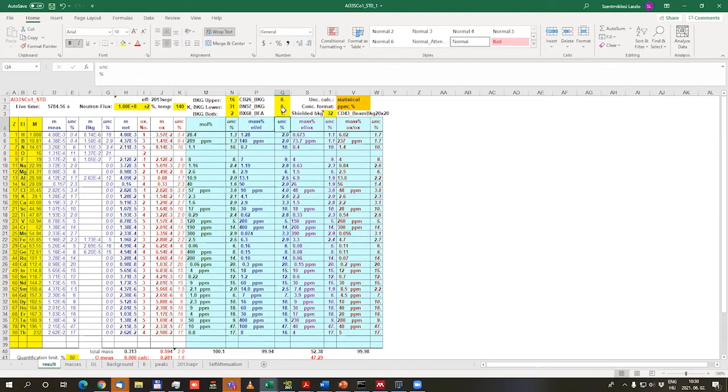So if I set a background spectrum, then background mass values will be entered here for relevant background components like hydrogen, boron, nitrogen and oxygen, which come from the air within the sample chamber.